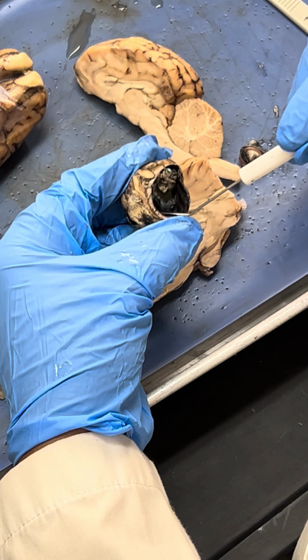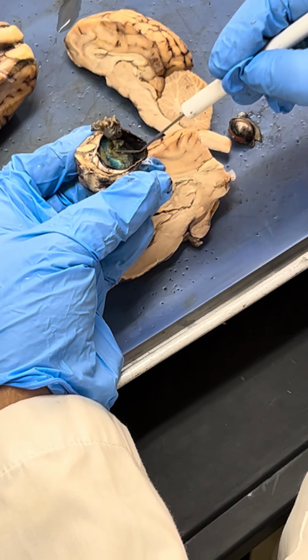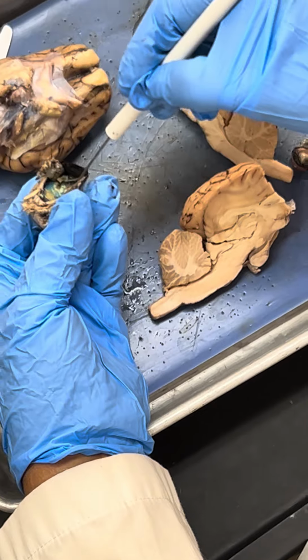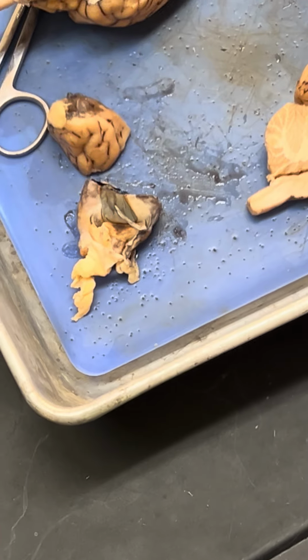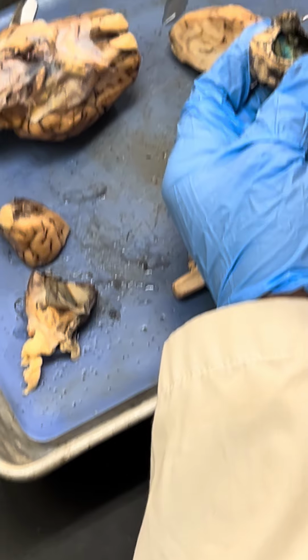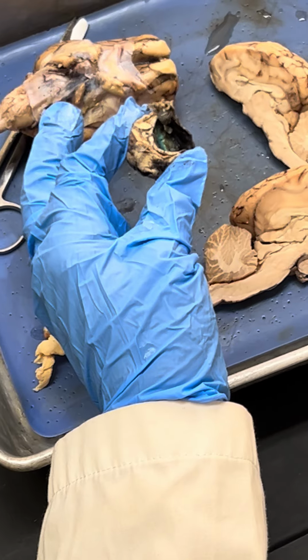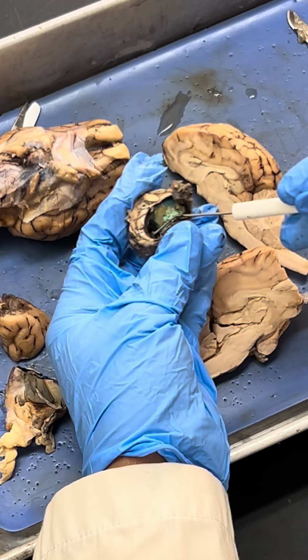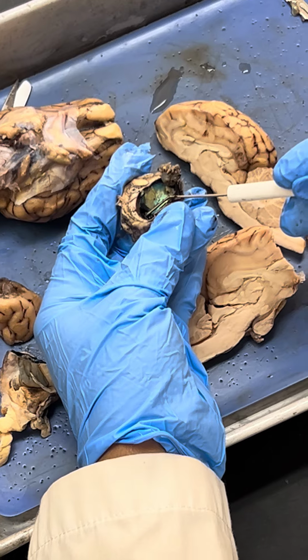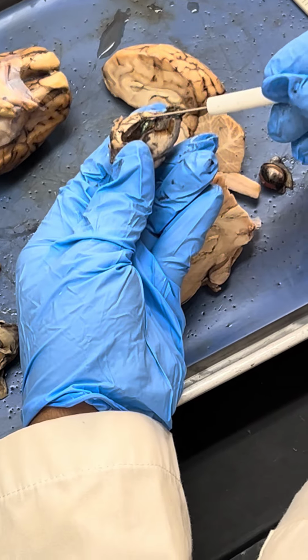Okay. Next, if you remove the retina, can you see this bluish shiny layer? All of you. This blue shiny is the iridescent layer. The iridescent shiny layer is the tapetum lucidum. The question will be like this. What's the name of the iridescent layer? What's the name? Tapetum lucidum. The black is known as the choroid coat. Choroid coat.